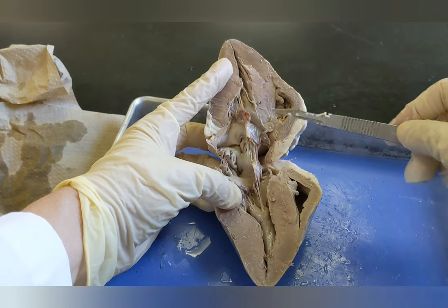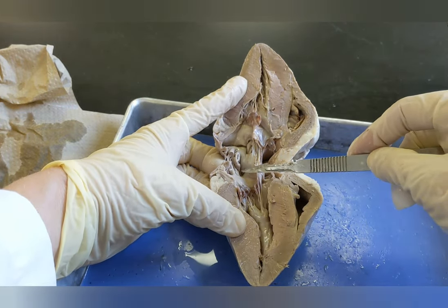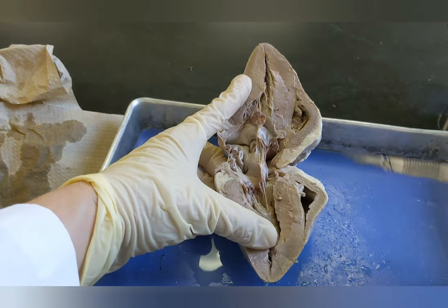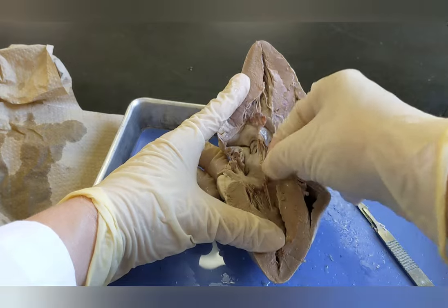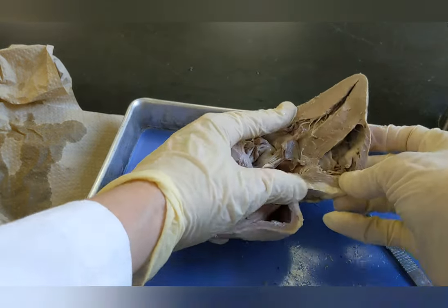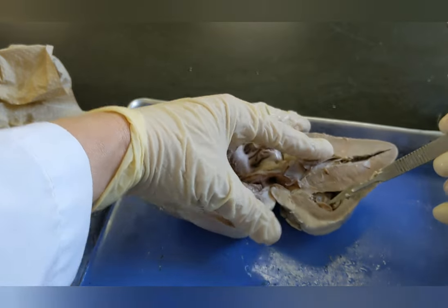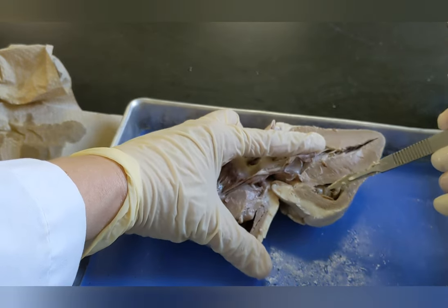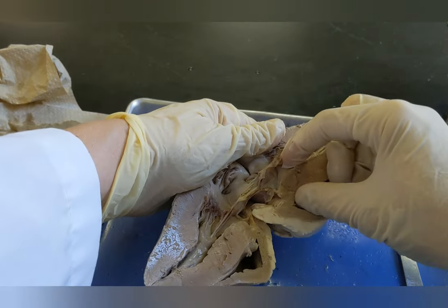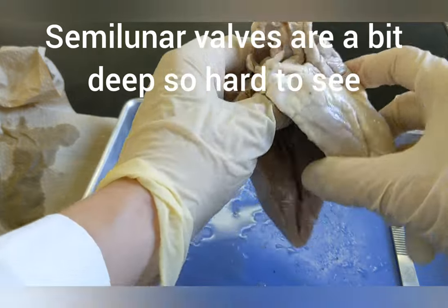Your atrioventricular valves are the only ones you'll be able to see — the valves between the atrium and the ventricle. The valve on the left side of the heart, between the left atrium and the left ventricle, is known as the mitral valve or the bicuspid valve. The valve consists of flaps and strings; the strings pull on the flaps to open and close the valve. On the right side it's harder to see the valve, but the valve between the right atrium and the right ventricle is the tricuspid valve. Both of those valves let blood go from the atrium into the ventricle and keep it from coming back. You're probably not going to be able to find the aortic valve or the pulmonary valve — those are the semilunar valves and they are very hard to locate during a dissection.